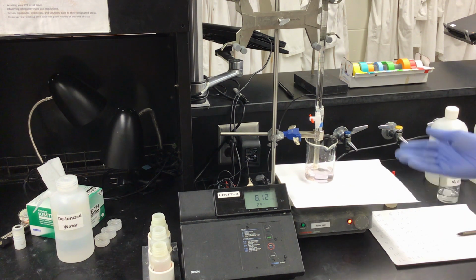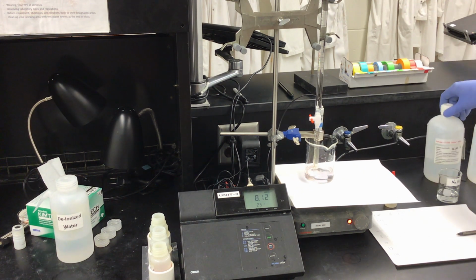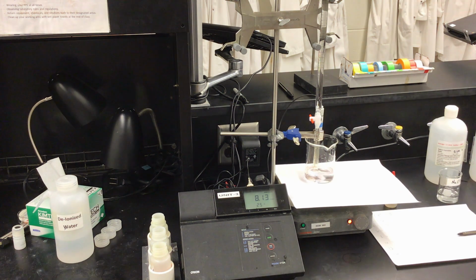20 seconds have passed and our pink indicator is still there. This means that we are done with this titration, and we have used 25.2 milliliters of our 0.1064 molar sodium hydroxide. We can now calculate exactly the molarity of our unknown hydrochloric acid. To be sure about this, I will repeat and do one more titration, and that will allow us to have 2 data points to know exactly what our molarity of our hydrochloric acid is.